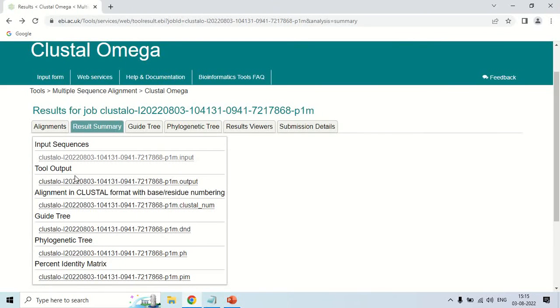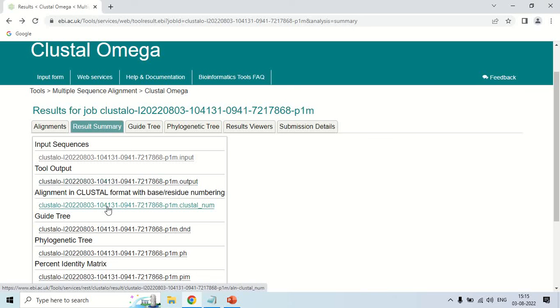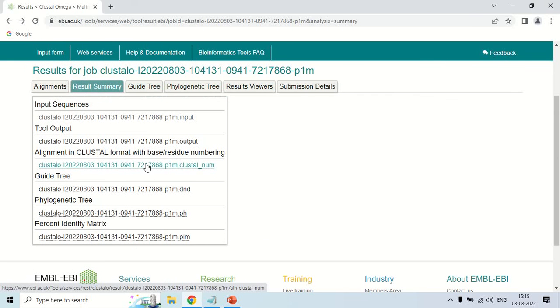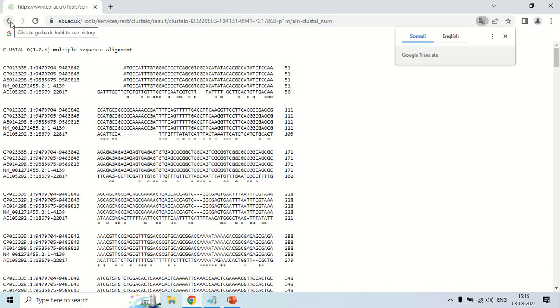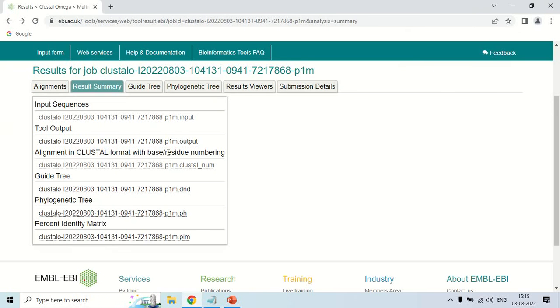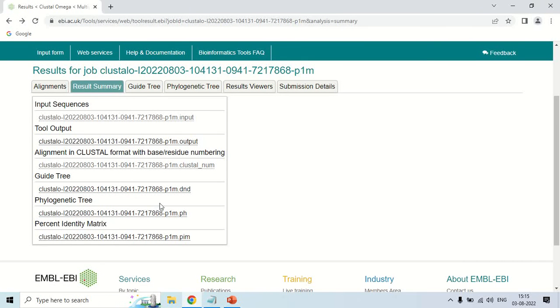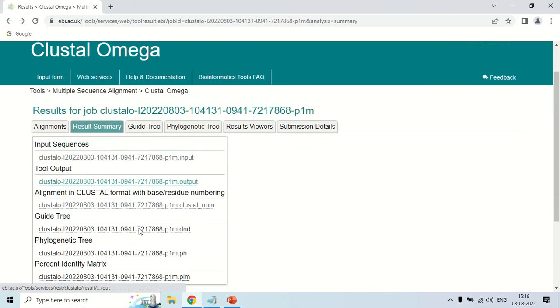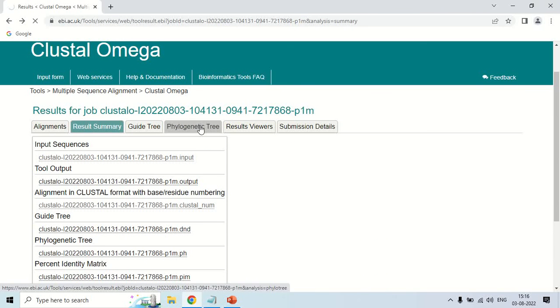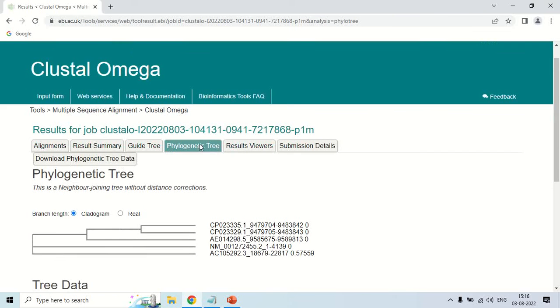Similarly, the 'Output' tab — if you click here — will show you the output sequences. The 'Alignment' tab shows you the alignment as discussed. There is also a 'Phylogenetic Tree' tab: if you click it, you will see the phylogenetic tree of these sequences. The tree is displayed as a cladogram, and you can see the five sequences with their accession numbers.